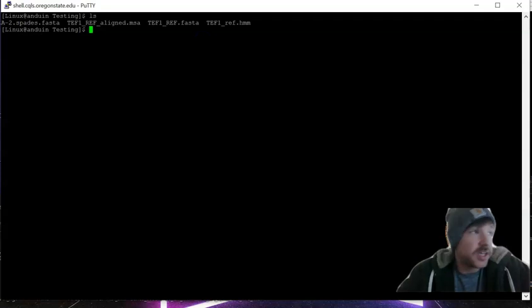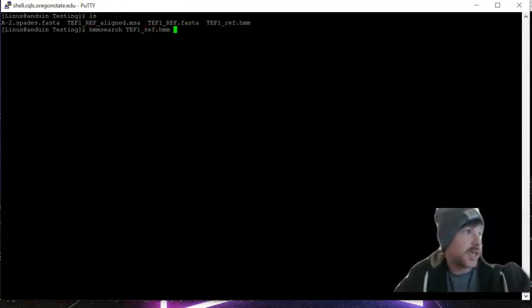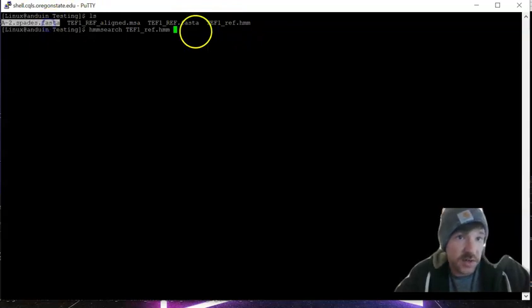So we've made our .hmm file. We have our spades or our scaffolds.fasta file, which is our full genome sequence. So then you might see this hmmsearch. This is what I was trying to use originally. You have hmmsearch, your freshly made .hmm file, and then your test file.